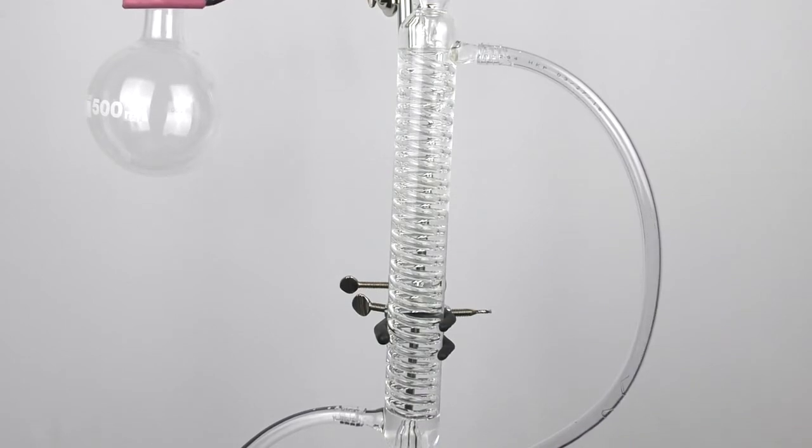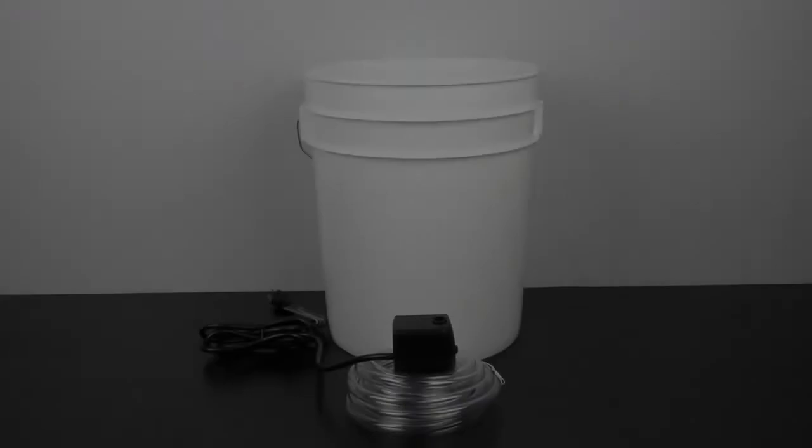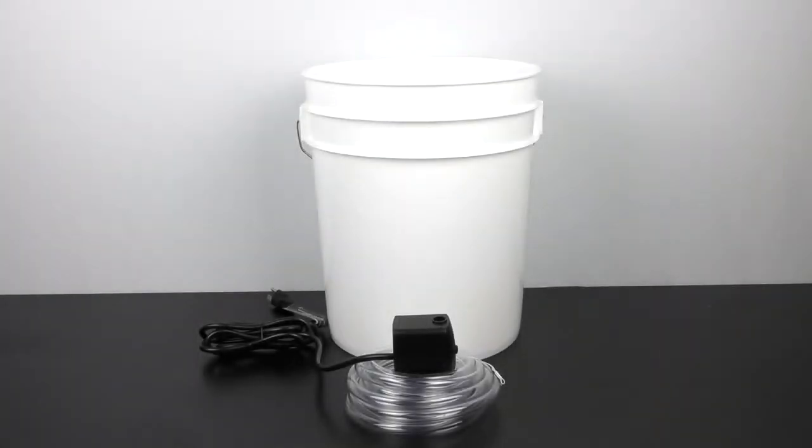You can get an expensive chiller unit or you can use a simple bucket with a pond pump, some ice water, and some tubing.